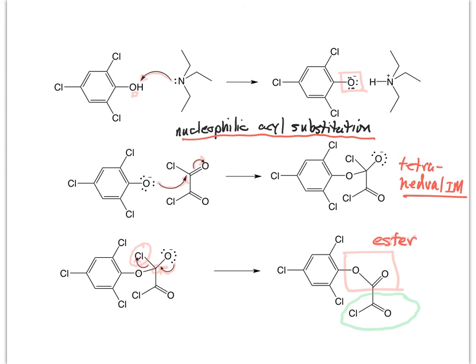So the second step is to repeat with another trichlorophenol. So just do it again, right?